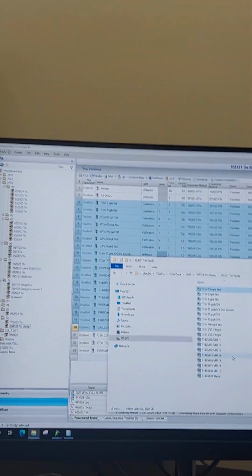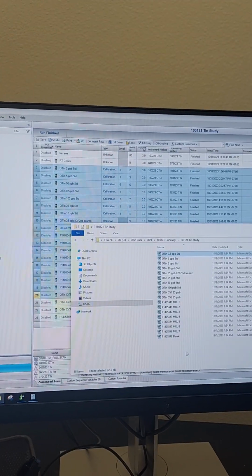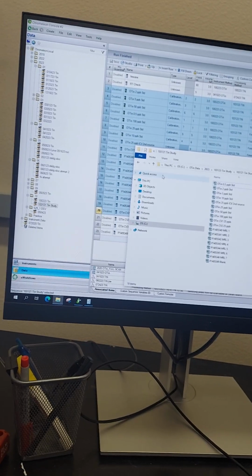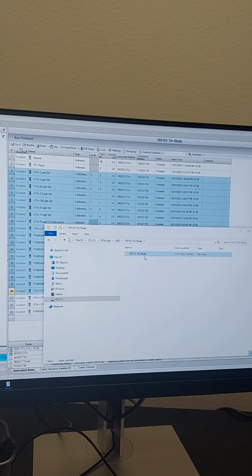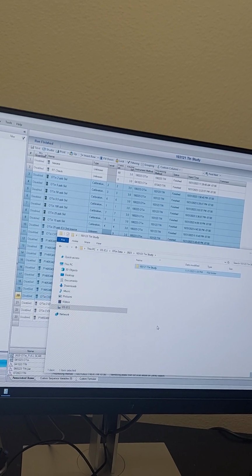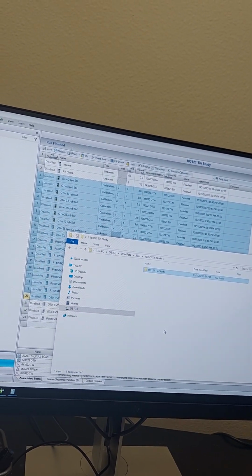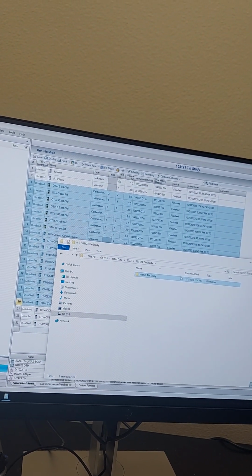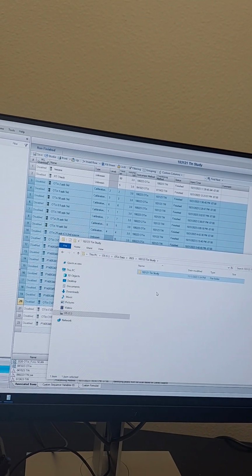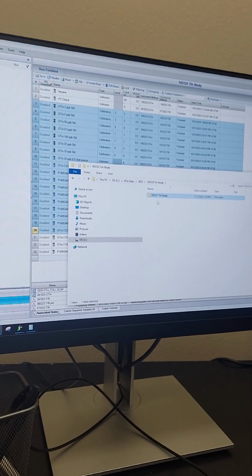So now we need to run the macro. What file do you use for the macro? I mean, you need to do it on a different computer. It has LIMS. You don't need LIMS to generate the data sheet. You do need LIMS for the entry. So yeah, I think when you finish right now we could move to another computer.